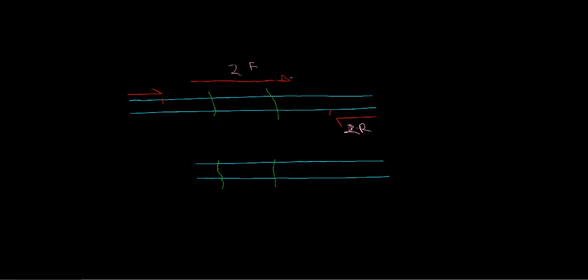And this chunk is going to have about 20 base pairs upstream of the area that we want to mutate, and 20 base pairs downstream of the area that we want to mutate. And we get this area that we're going to mutate. We're going to come back to this in a second.